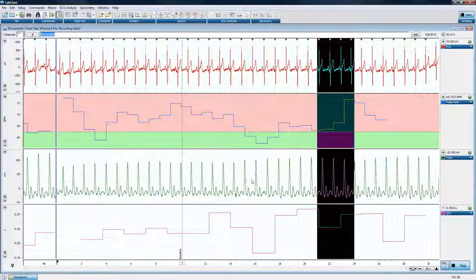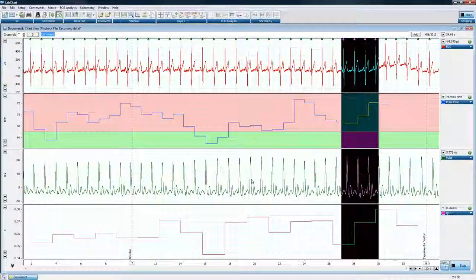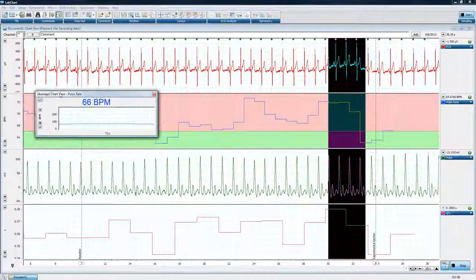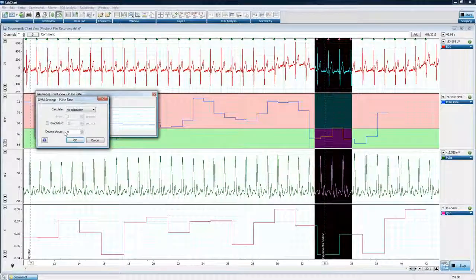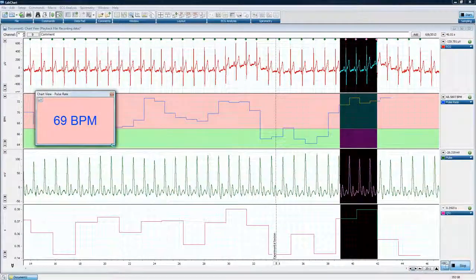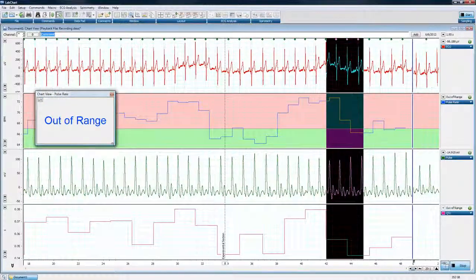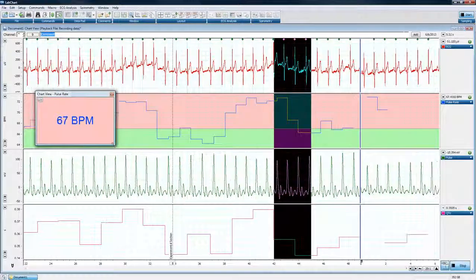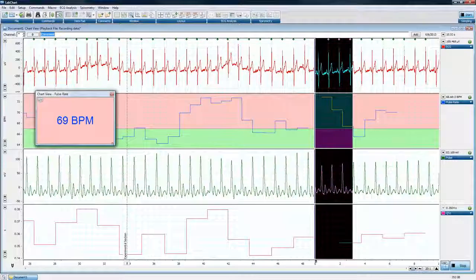And the really cool thing about this is after you click OK, you can then see that very visually in the channel. Not only can you see that visually in the channel, if you have a DVM open. Now, this doesn't work if you have the calculations running. So if I turn off my calculations here, the DVM will actually change colors according to what you're seeing in the chart view. So a really cool feature, allows you to see what's happening in a given channel.